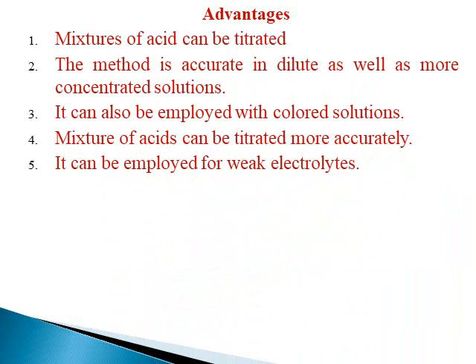Now, when you look into the advantages: mixtures of acids, various mixtures of acids, strong and weak, can be titrated to obtain the equivalence points. The method is accurate in dilute as well as more concentrated solutions, for the normality and the amount.